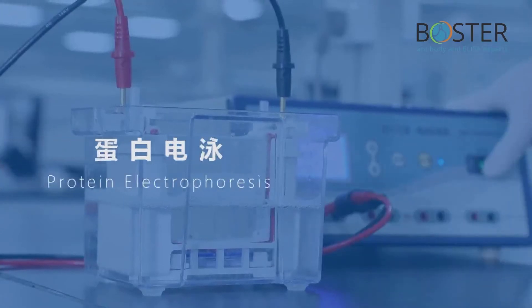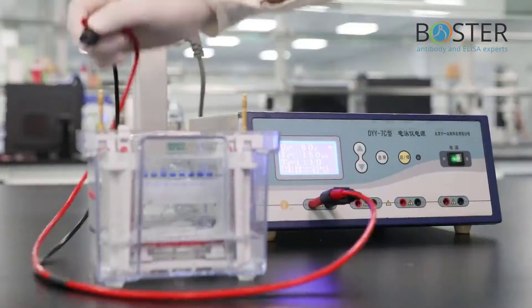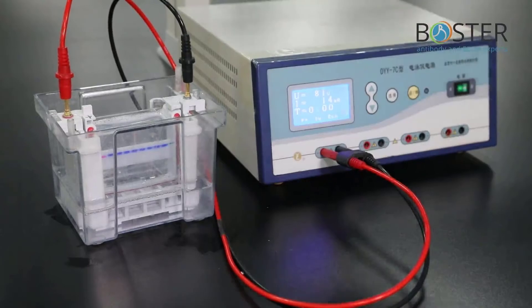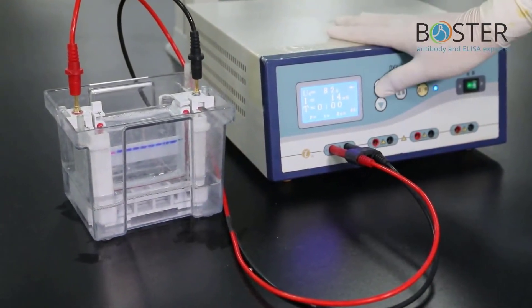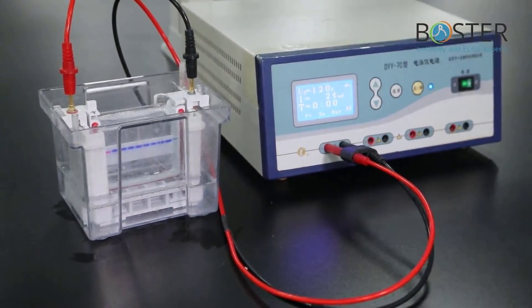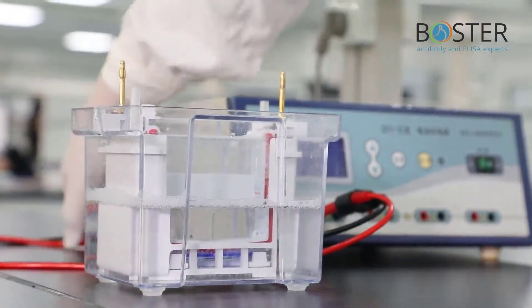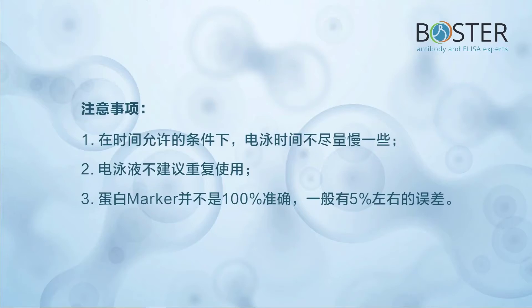Step 7: Protein electrophoresis. Start electrophoresis. When bromophenol blue runs to the junction of the stacking gel and the separating gel, adjust the voltage to 120 volts. Stop electrophoresis when bromophenol blue runs to 0.5 cm from the bottom of the gel. Precautions: 1) Under time-permitting conditions, electrophoresis should not be too fast. 2) The electrophoresis solution is not recommended to be reused. 3) Protein marker is not 100% accurate — generally there is an error of about 5%.